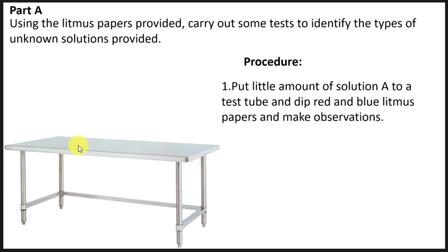So we get solution A and then a test tube. Then we get some few drops using a dropper. You press the dropper and release it so that it sucks solution A. Then you push the solution A so that it goes into the test tube.